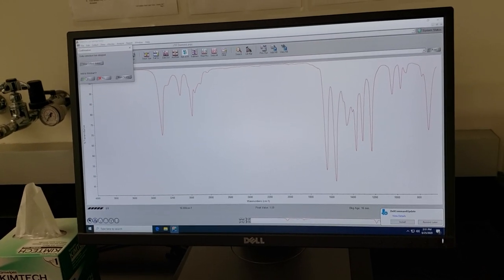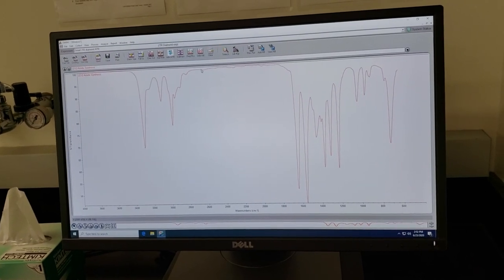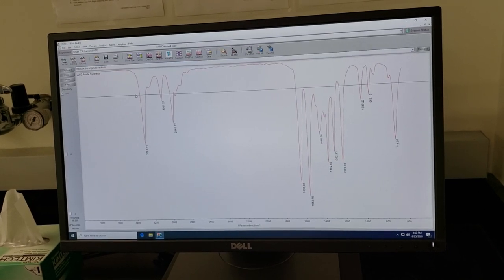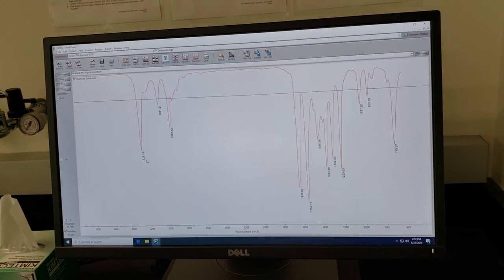Okay, we'll add this to our window. I'm going to go ahead and find peaks here. Let's find our peaks. That looks like a good set there. So now we've got all of our peaks up above 3,000 or right at 3,000 marked.